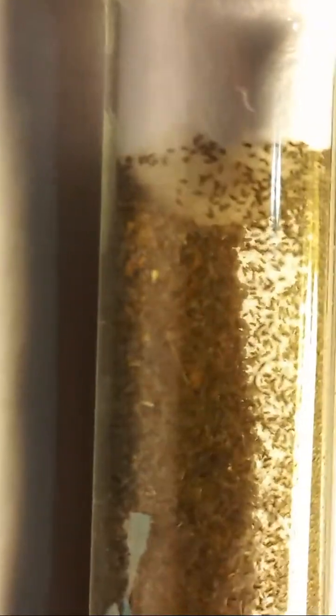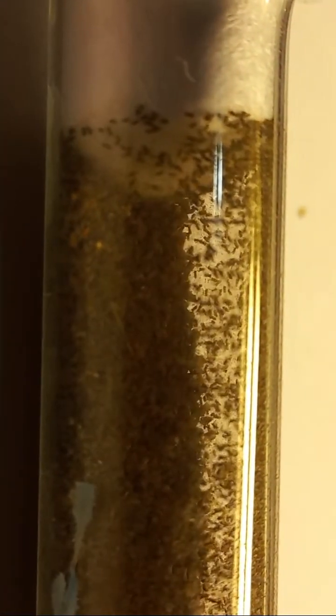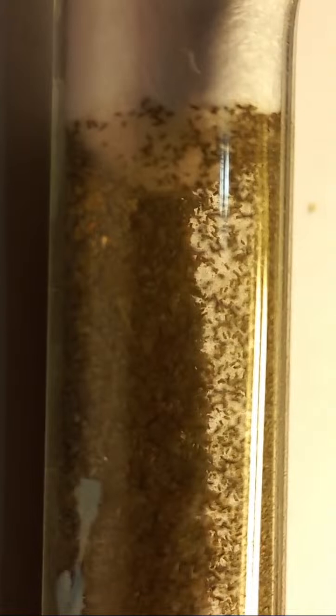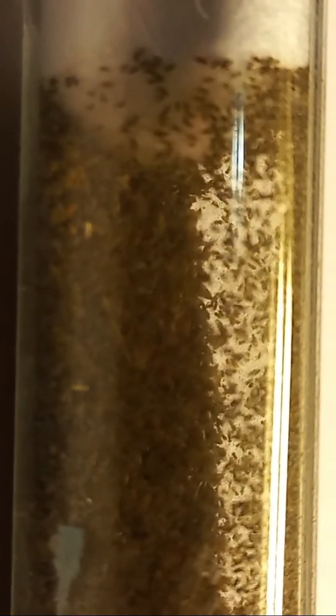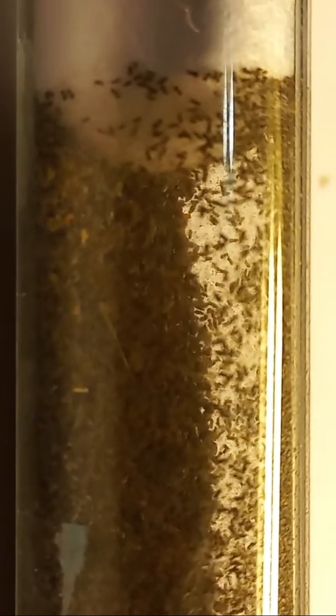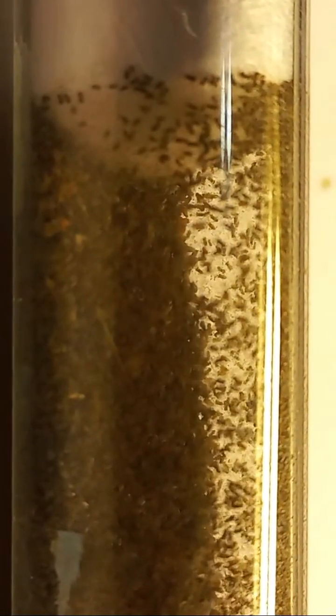We're sitting here in this cage in large number, just because we just hatched from the grain moth Sitotroga cerealella. I cannot make huge magnification because for my previous video I used a different microscope, and now I'm just taking video directly online from a glass tube with thousands of tiny specimens of Trichogramma egg parasitoids, important biological control agents of agricultural crops.